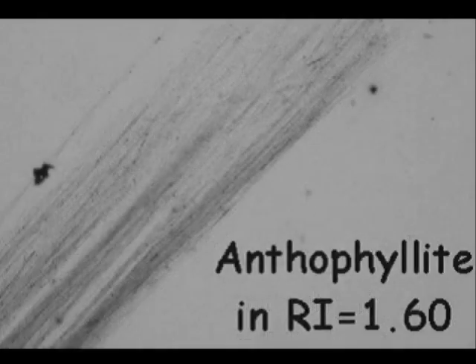This picture, on the other hand, shows the same substance but lighter. Therefore, the relief is low between anthophyllite and the mounting medium. This leads to the conclusion that anthophyllite's refractive index is close to 1.6.